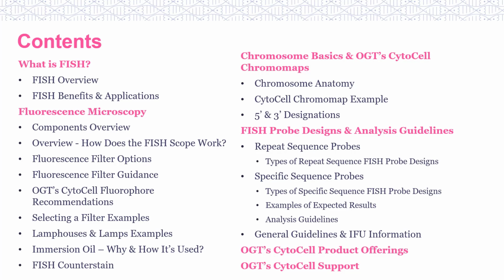Most LDTs in the US are regulated under the CLIA regulations, and labs should always follow the necessary regulations to maintain CLIA compliance. We will be reviewing the differences between FDA-cleared probes and ASRs more in-depth in the CytoCell University FISH 103 session. Stay tuned for its release.